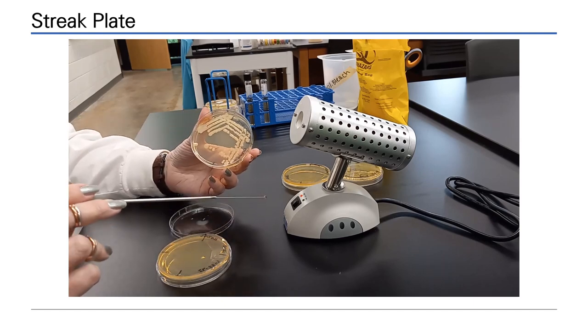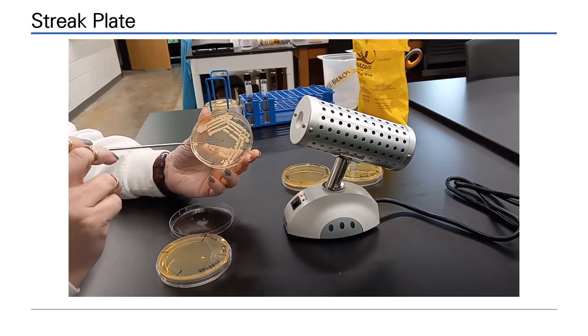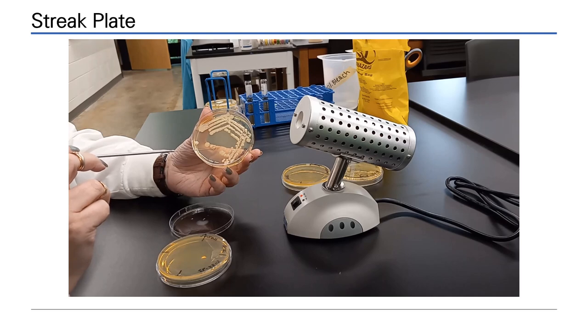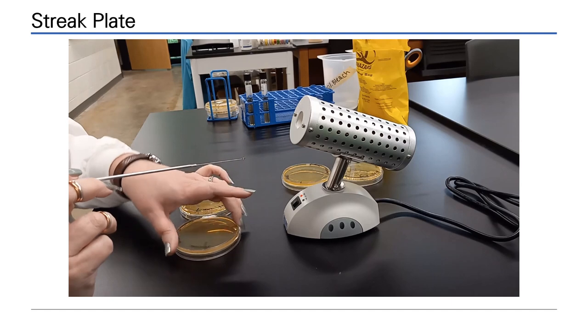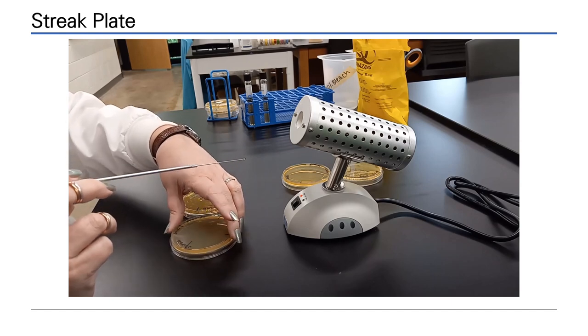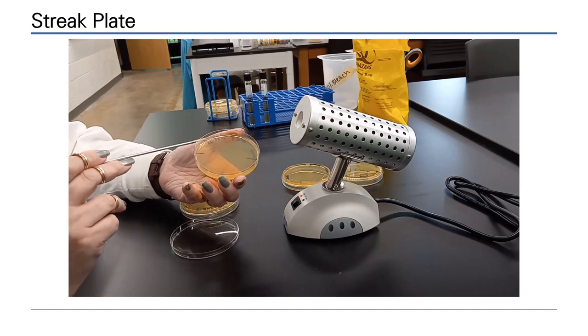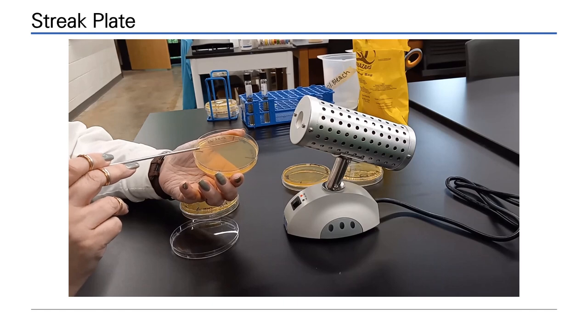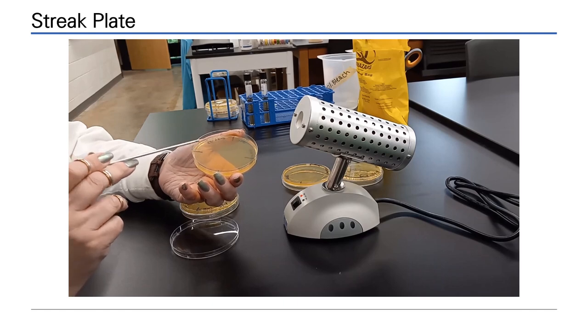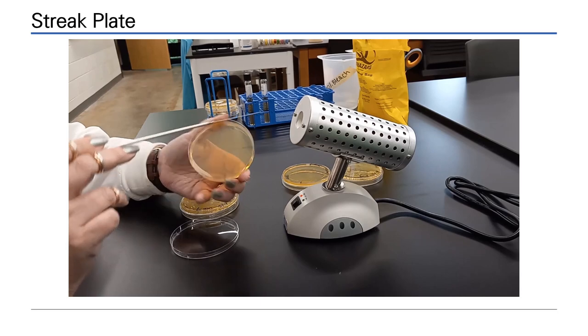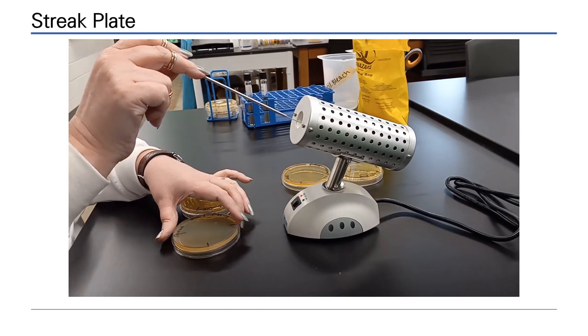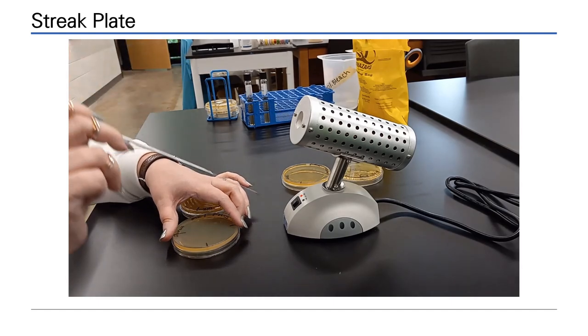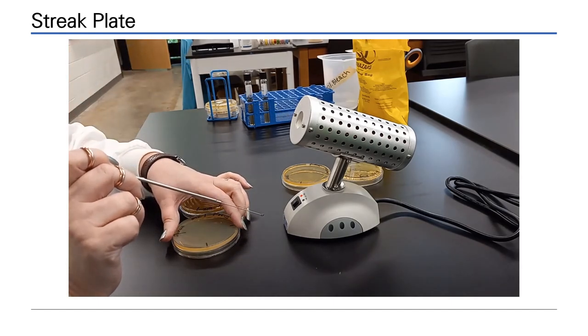Now the staph aureus will be inoculated. Notice how the loop is touched to the center region of the plate. This is just a check to make sure that the loop is cool. Only touch the loop to a sterile region of the plate if you want to perform this check. Watch each step again, how the plate is streaked, the loop is sterilized and the next quadrant is streaked.